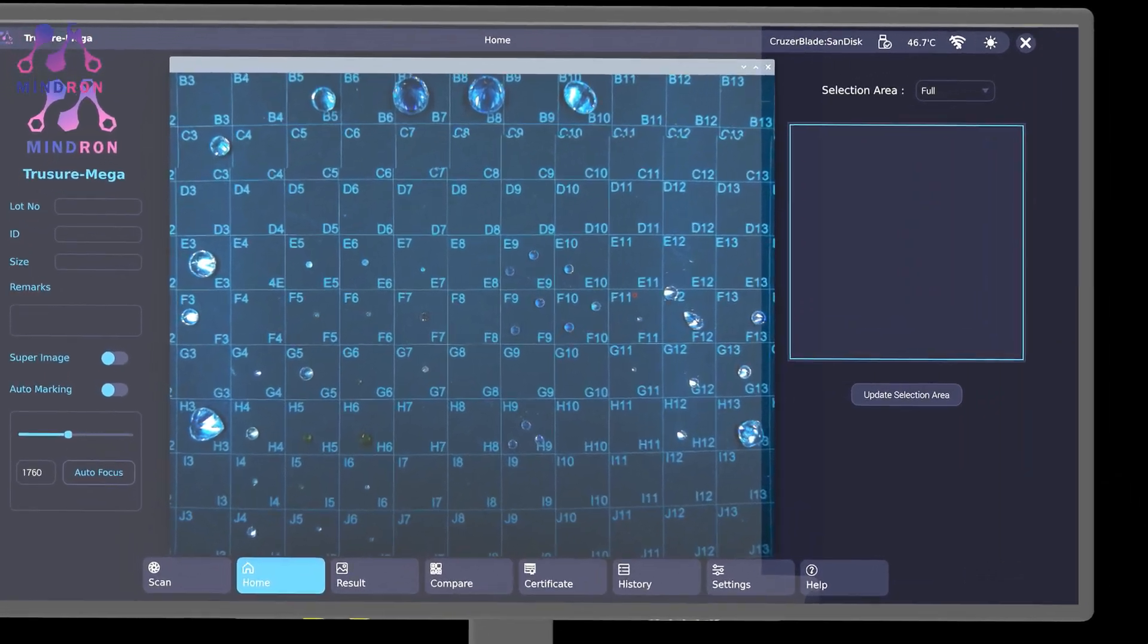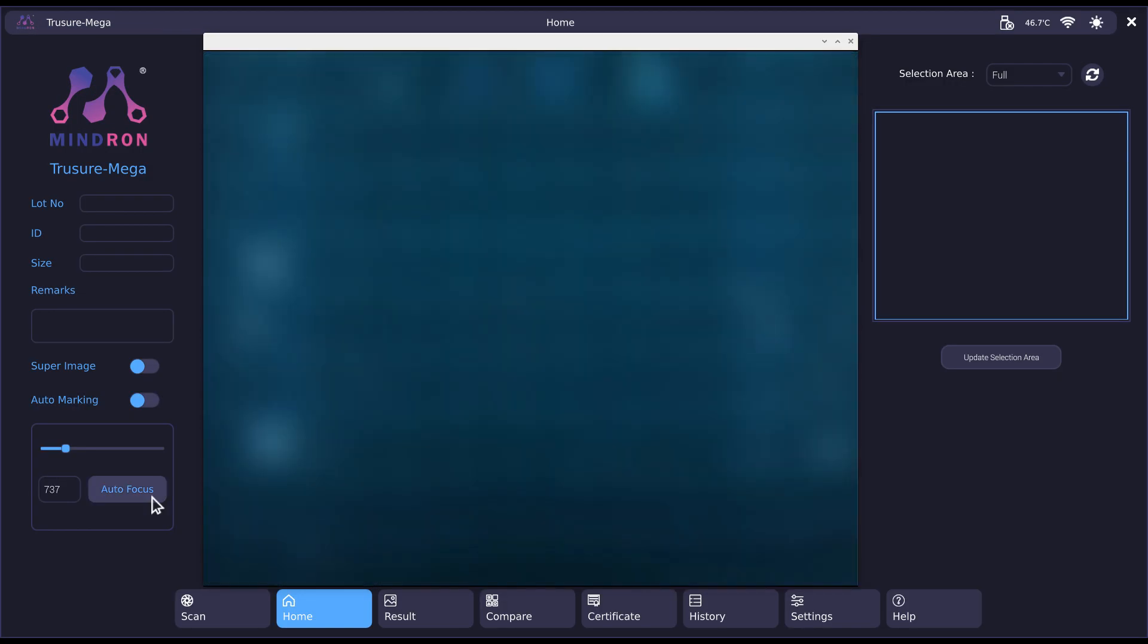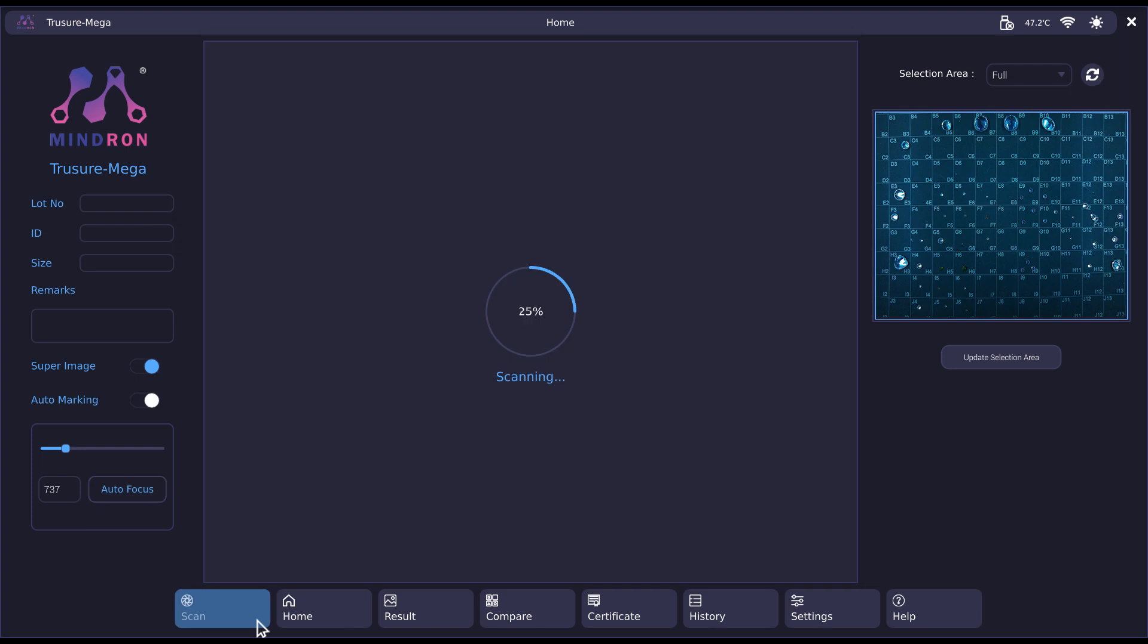Now comes our user-friendly and advanced software. Simply press the autofocus button to automatically adjust the focus. Now press scan and let TruSure Mega do the rest.